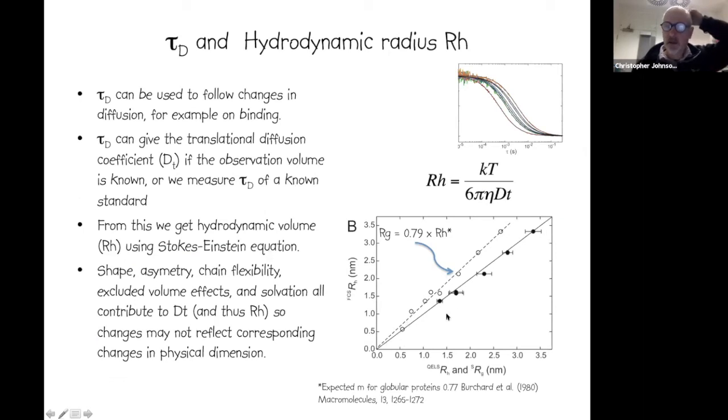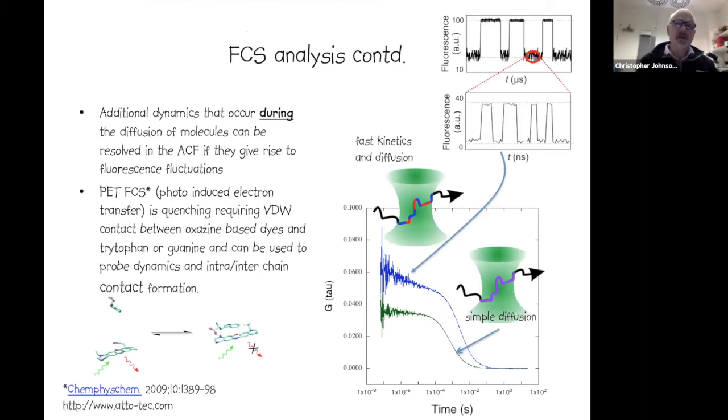You can see that we get very good agreement between the measured values on the FCS and those measured using other techniques.